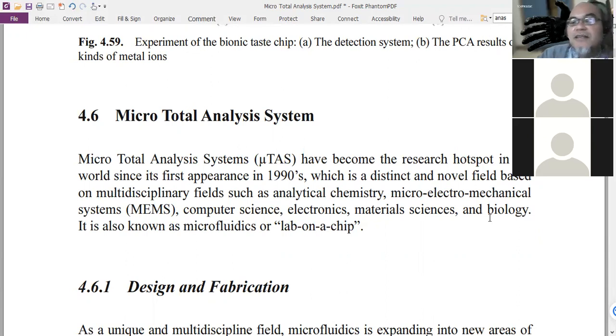Only for the PCR analysis, however, since you require operation at high temperature, until 95 degrees, you cannot use simple wax. The previous group, Diana and Elnora, and Maria and Michael, they used epoxy in their report, right? Because epoxy can withstand temperatures as high as 95 degrees, the temperature that you need for denaturation of DNA.